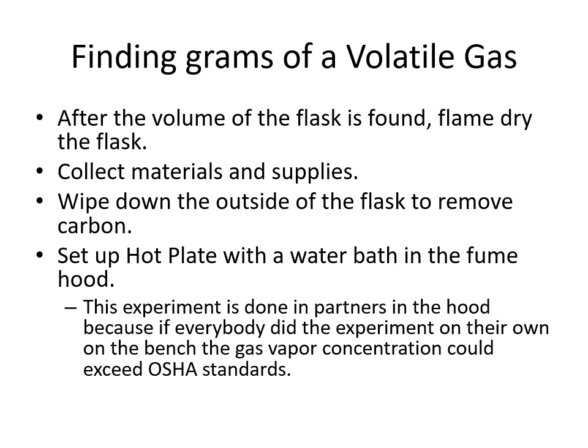The reason we work on it in the hood is because as we're volatilizing the liquid, as we're turning it into a gas, some of it is escaping from our flask and those vapors enter the room. With enough people doing this experiment, when the vapors enter the room, it can get pretty stinky, and we don't want to expose people to all the vapors of the unknowns.